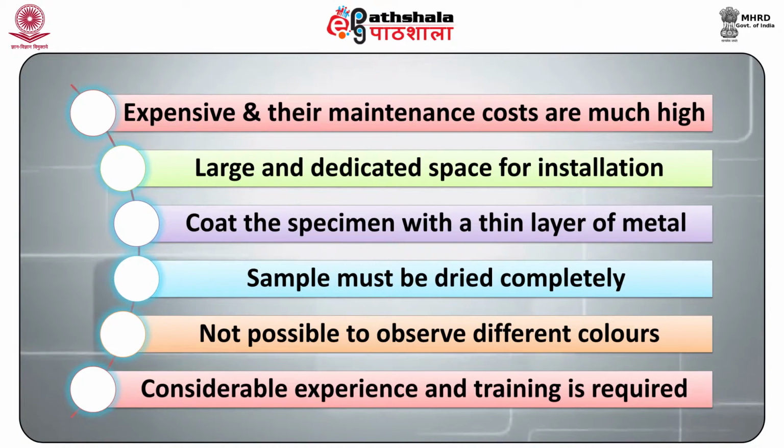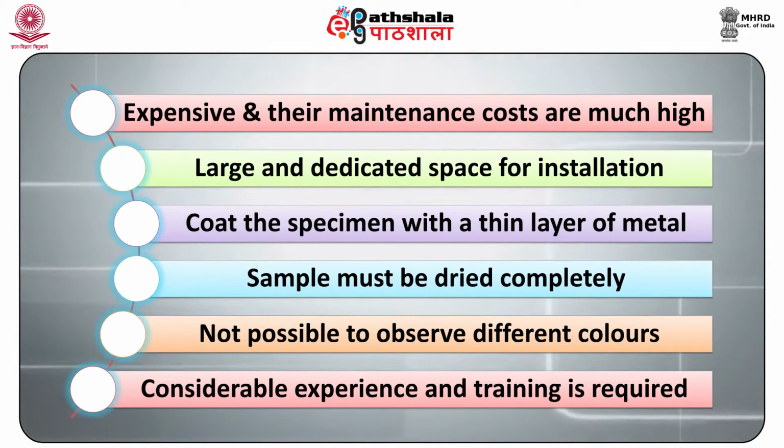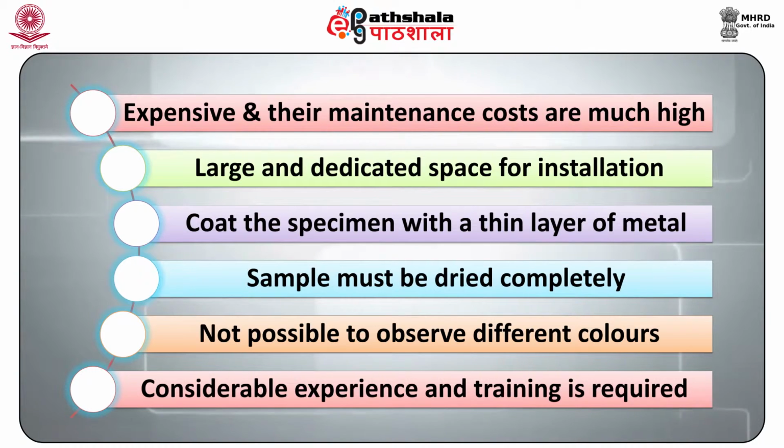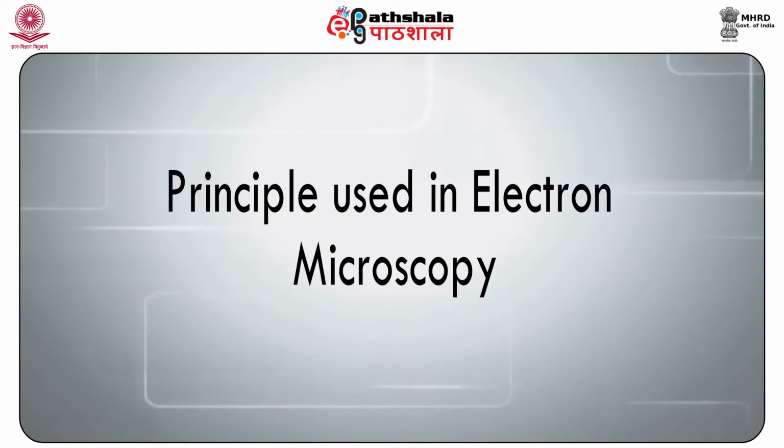It is also not possible to observe different colors in an electron microscope. Considerable experience and training is required for experts to identify artifacts.